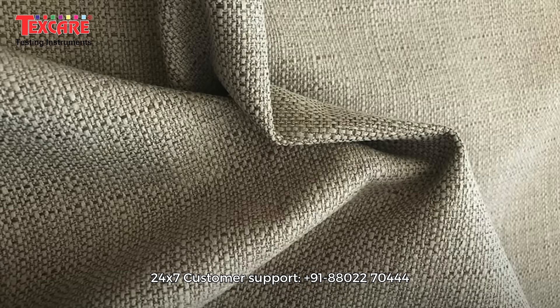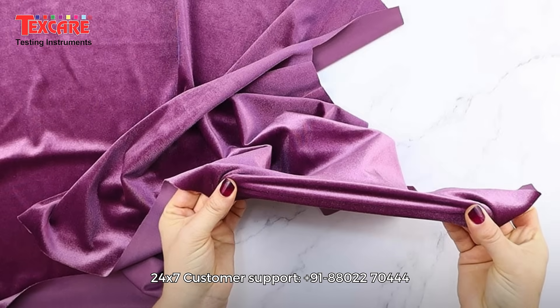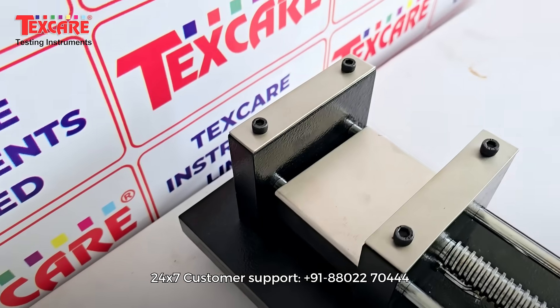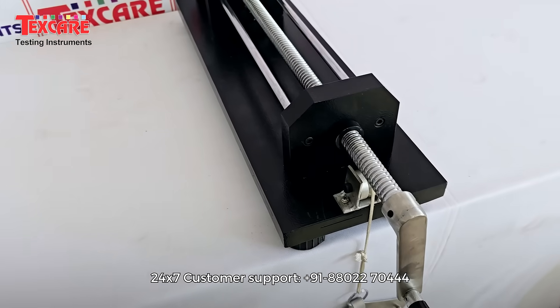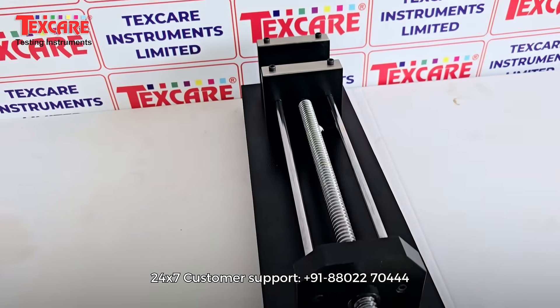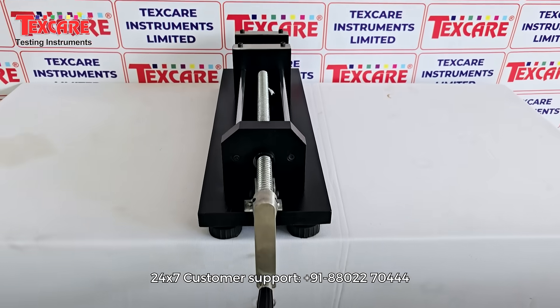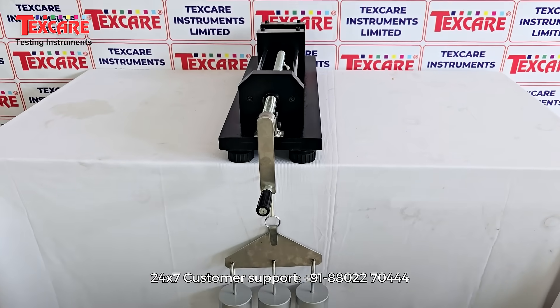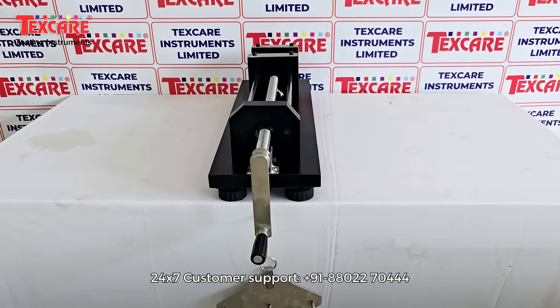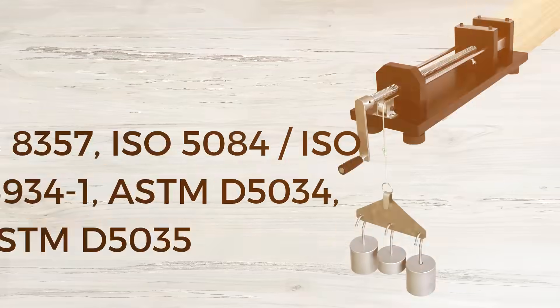Whether it's woven, knitted, or elastic textile materials, the Fabric Extensometer ensures that every sample meets the highest standards of performance, durability, and comfort. Equipped with a high-precision measuring scale and ergonomic clamping system, it allows smooth and accurate measurement of fabric extension under specified loads.